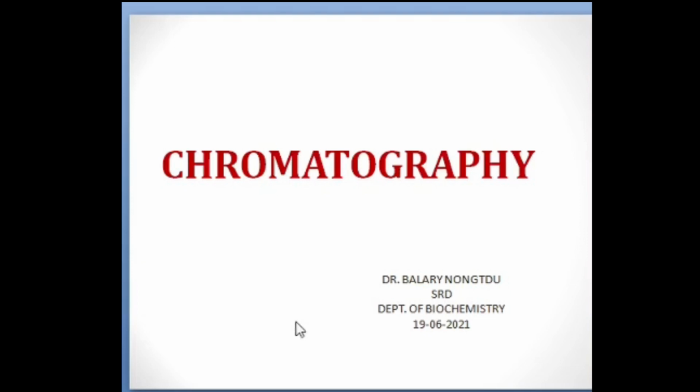I'm going to take on chromatography. So kindly answer back if I ask any questions. So chromatography, from the word itself, means writing in color. The word chroma means color and graphy means to write.